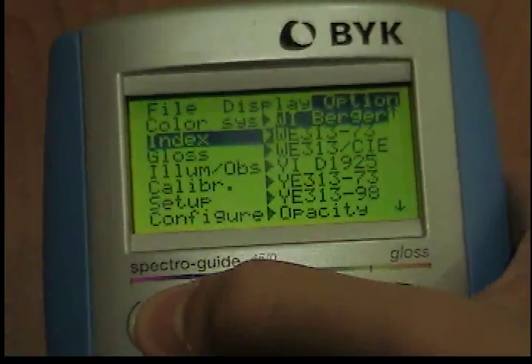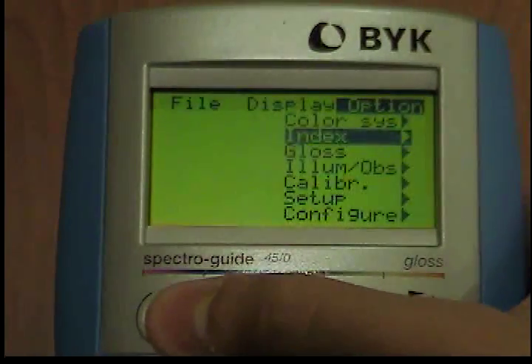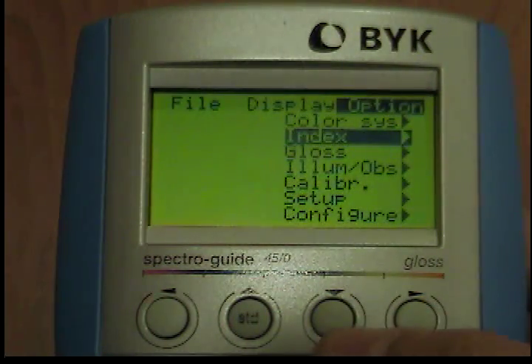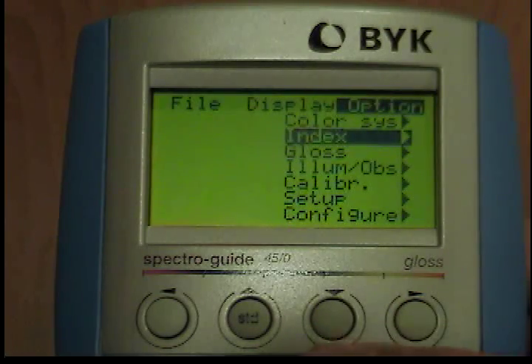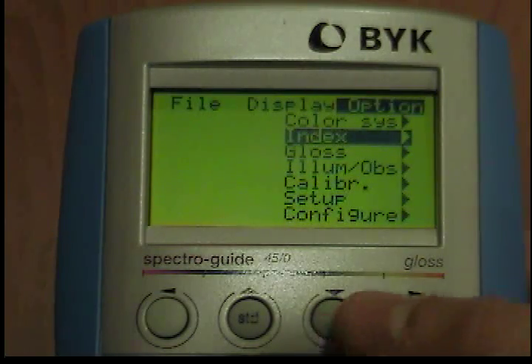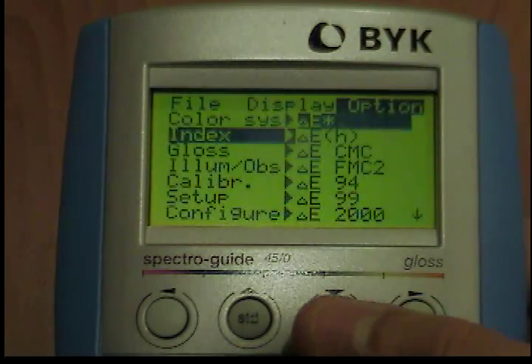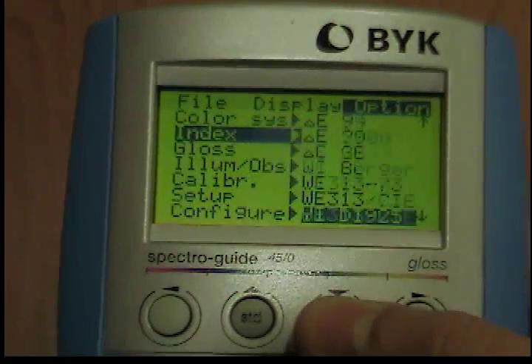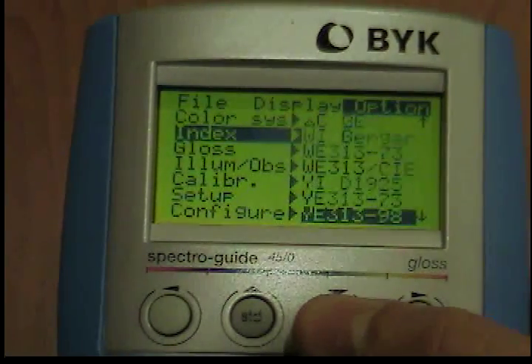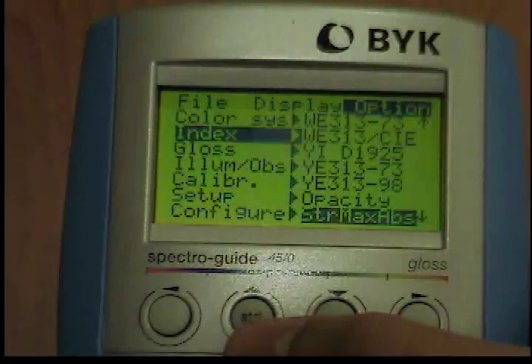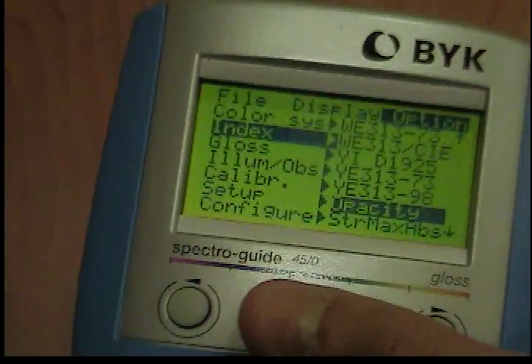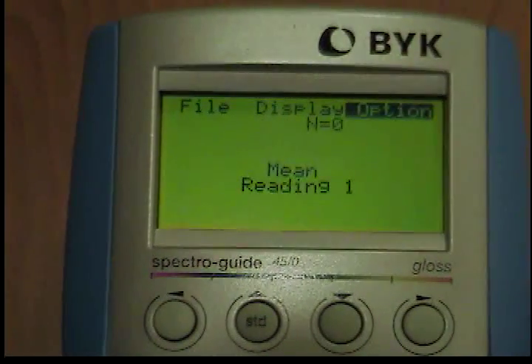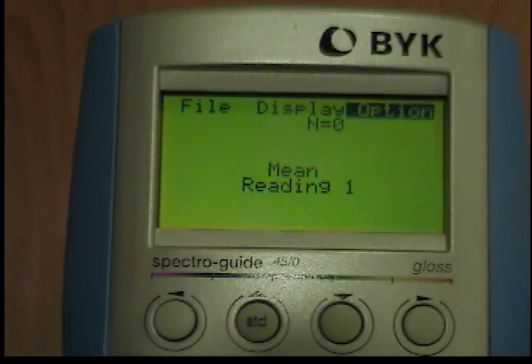The opacity function can only be performed in difference mode. To activate the function, move the cursor to the opacity option as described from the options index menu. The instrument returns to the measuring mode. After opacity has been selected, all values on the display are set to zero. To determine the opacity of the sample, use the standard button to measure the sample against a black background.